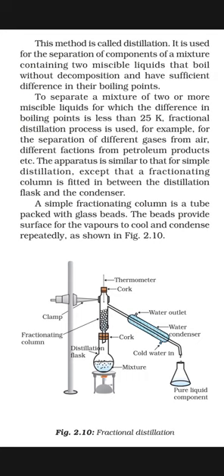fractional distillation. What is the difference between distillation and fractional distillation? The difference is that in the apparatus shown in this figure, we are going to use a fractionating column. That is the only difference. Everything else in the setup is the same. We have a condenser, a distillation flask, and a thermometer, everything pretty much the same, but the only difference is we are going to use one fractionating column.